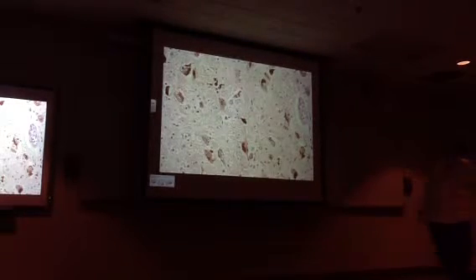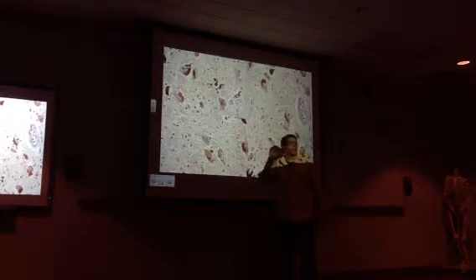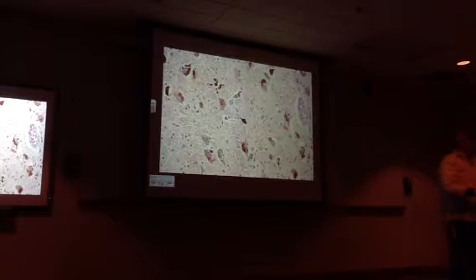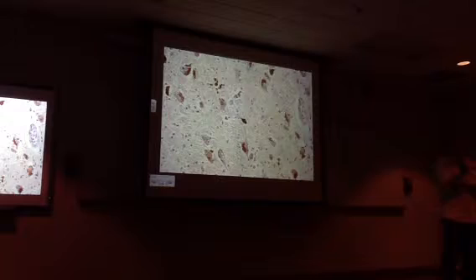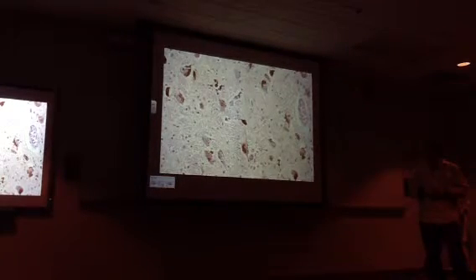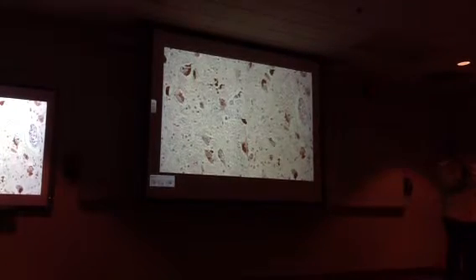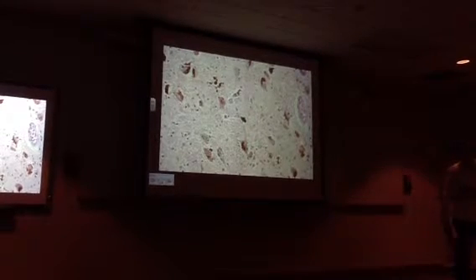I think that these are melanin granules in neurons, probably in the locus ceruleus. Melanin granules are a biosynthetic product involved in, this tyrosine is involved in that, and that's how we get some of the synthesis of dopamine. And when you're looking around on a glass slide, you can find these very characteristically in certain regions of the brain, like in the pons.